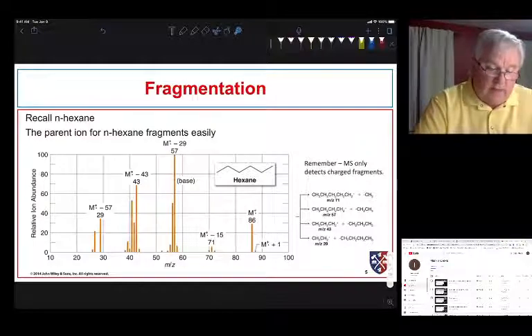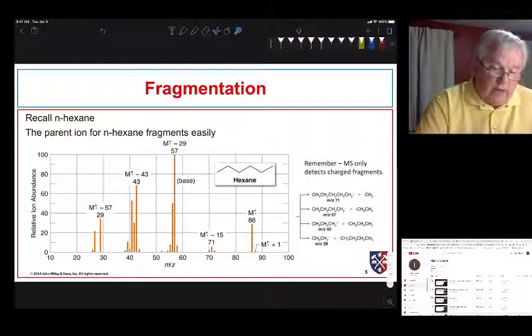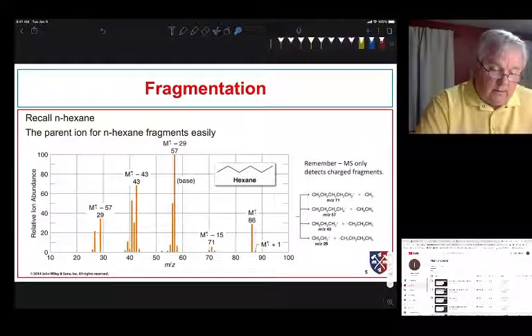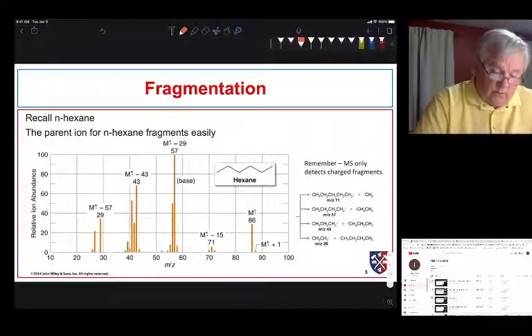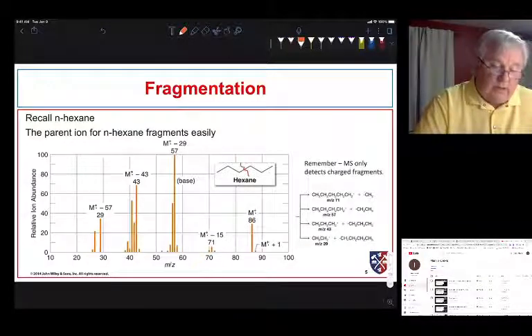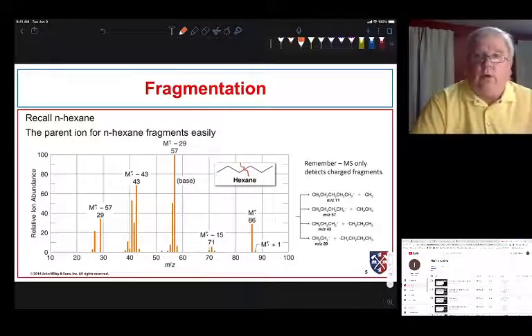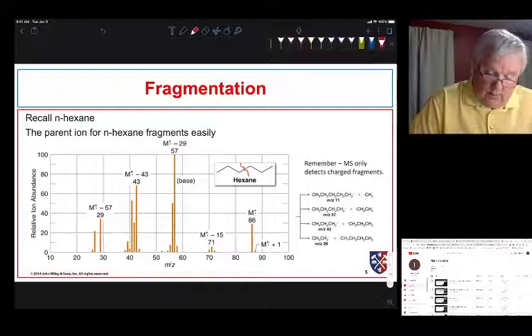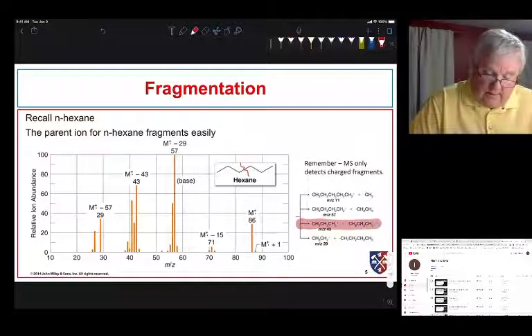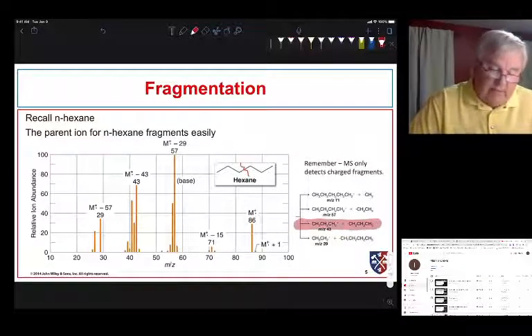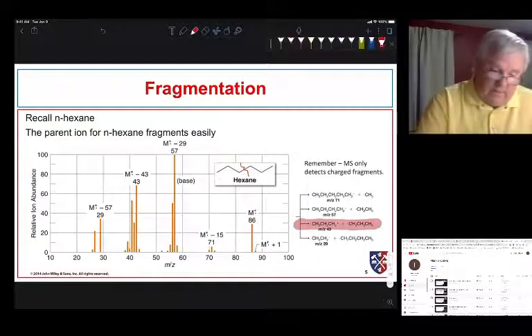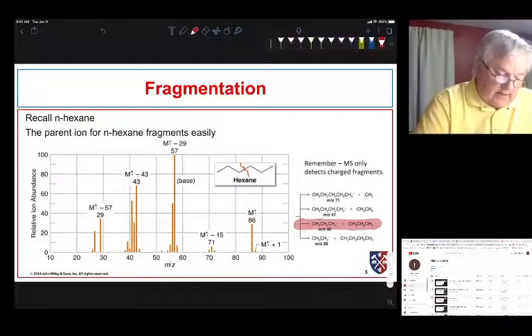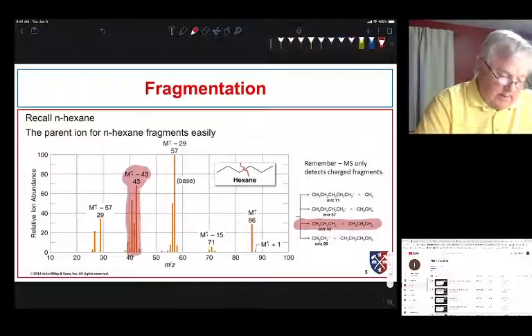Recall we looked at the fragmentation of hexane. We can break the hexane bond in different ways — cleaving in the center gives us a propyl radical and a propyl cation, and that is exactly what we see. There's fragmentation of the center bond that gives us a peak at 43.